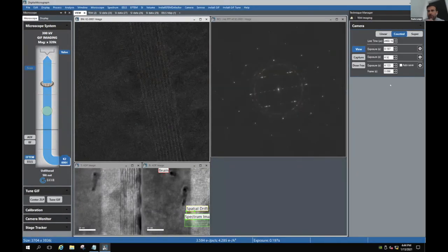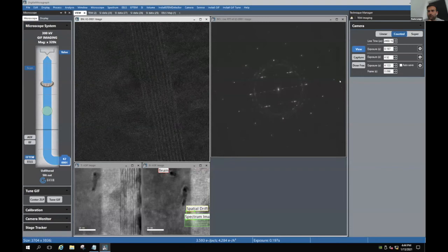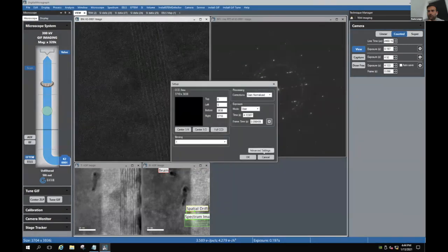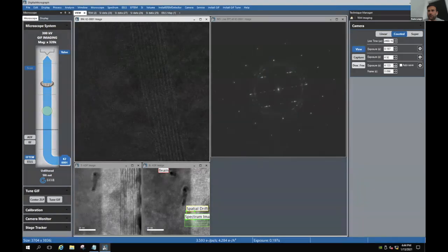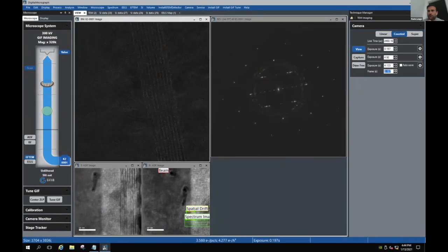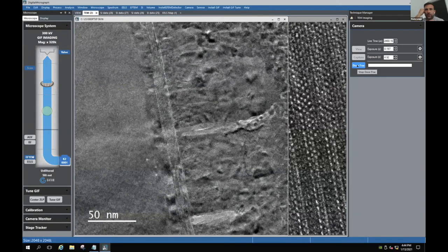And you can also say, okay, let's do the same thing. Let's do a one dose fractionation. And you have some. Sorry, I didn't mean that. I'm gonna try to do some super resolution after this, to see if we gain something there.